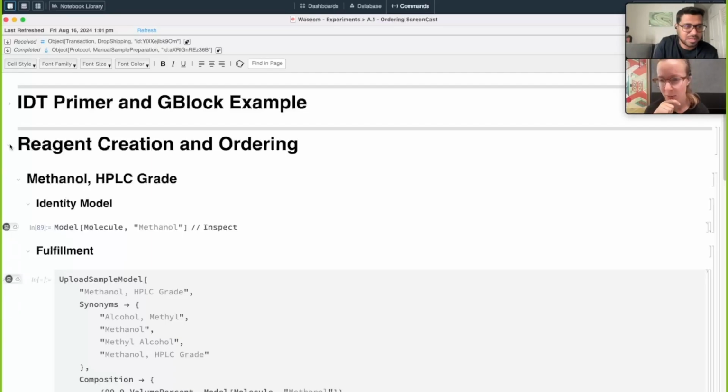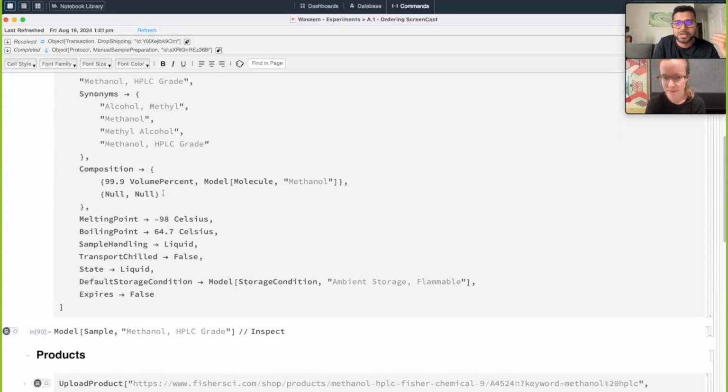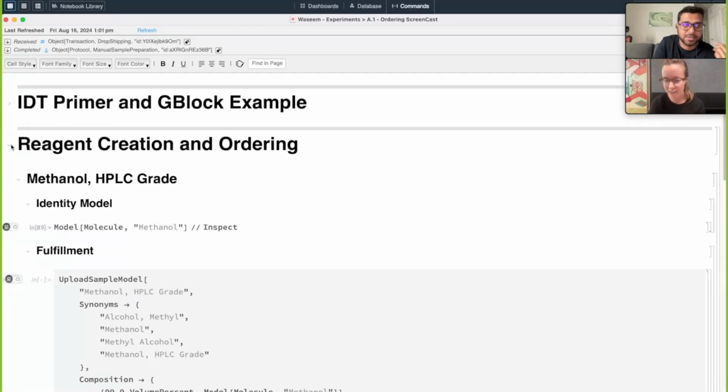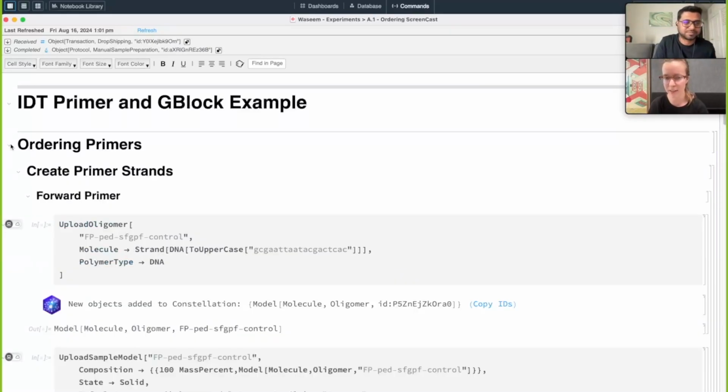Can you see if those ones have pictures? Those are actually not of different samples. Maybe I'm going to show you the samples for the DNA itself, it'll be much easier that way. Okay, very good. Let's go to DNA, and ordering DNA is a little more complicated because you have to define the molecule yourself. So one extra step there.